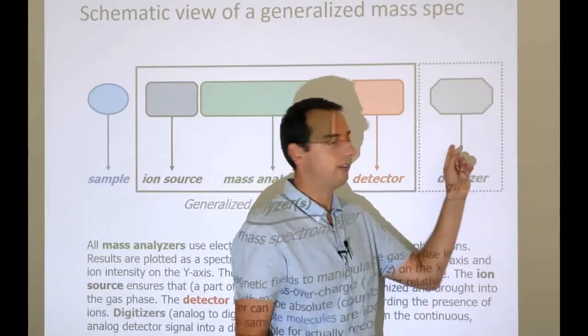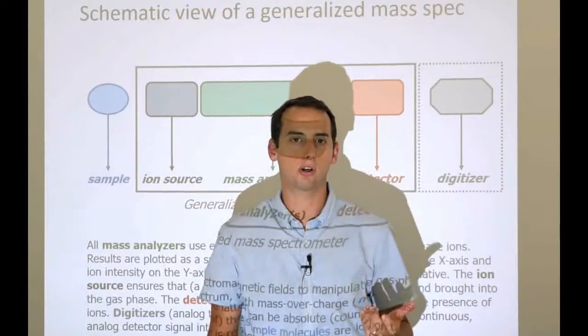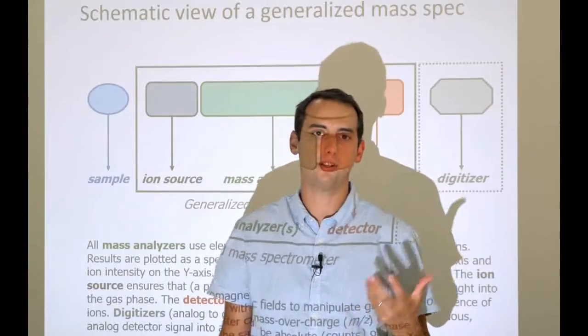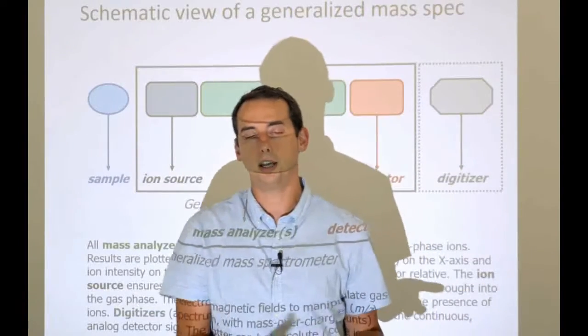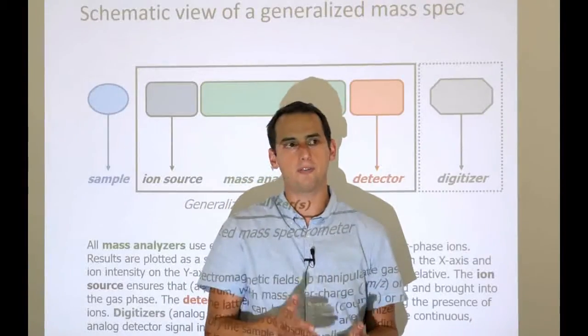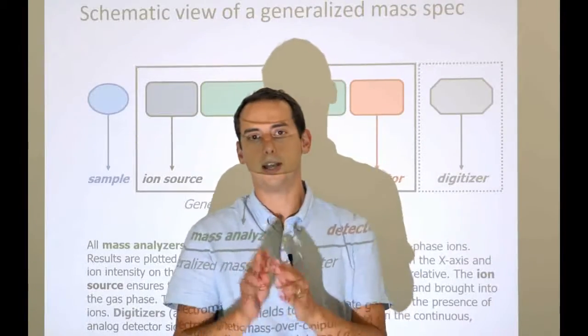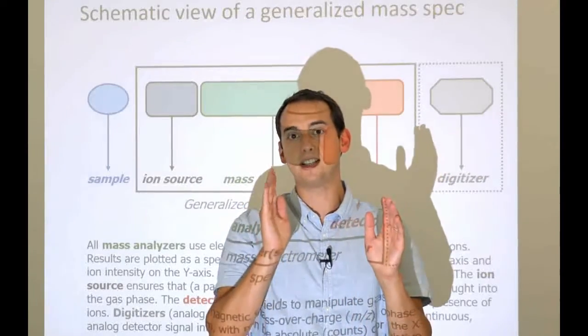And so that's where these things used to make a lot of difference, because they're essentially computers with an internal clock, and clock speeds are measured in gigahertz or megahertz. And some of you may remember that back in the day, and I'm talking about 10, 15 years ago, computers would tick at clock speeds of a few megahertz. And so that would be very infrequent compared to today's computers, which measure in gigahertz.